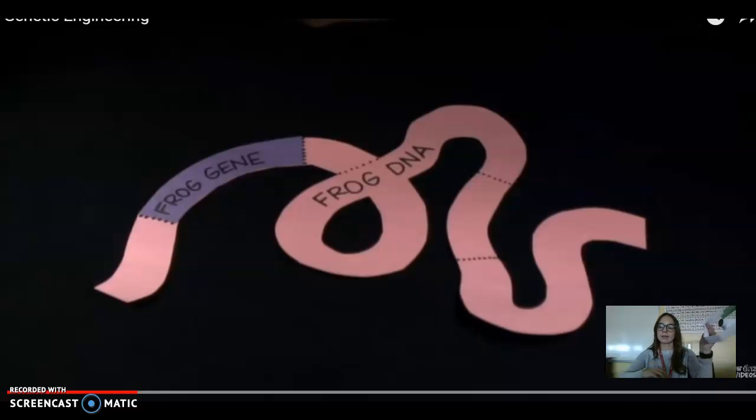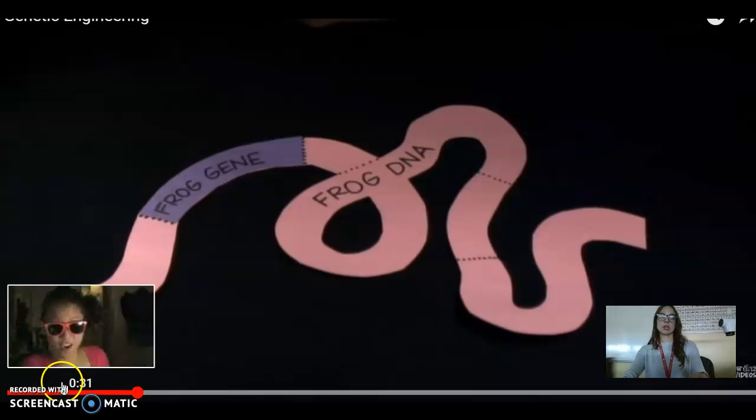Okay, so we have these plasmids, cool. How do we actually put them into a bacteria? This is just the DNA. So we have actual plasmids isolated that we can do this to, and somehow we need to get these into a bacterial cell.